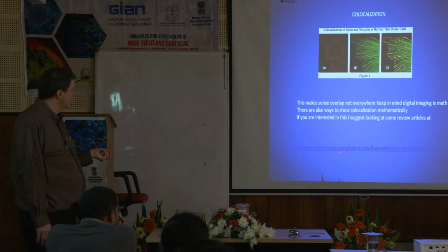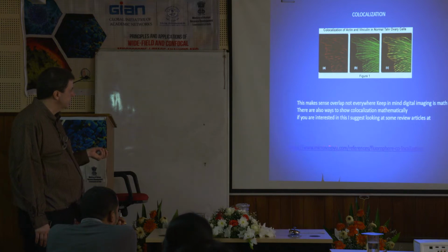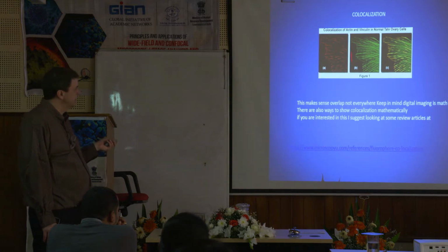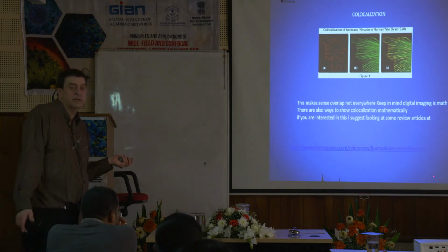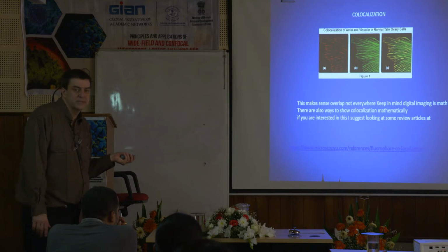But again, looking at the Microscopy U website, this is Nikon's website, a good explanation again of co-localization. So I encourage any of you who are going to be doing co-localization to read up on it, especially at the Olympus and the Nikon websites.